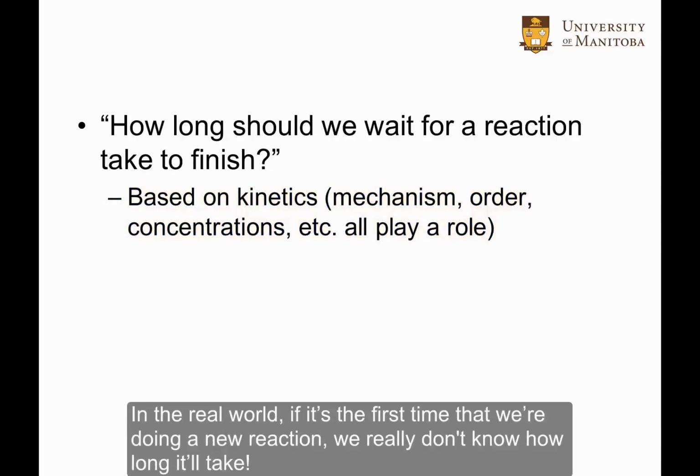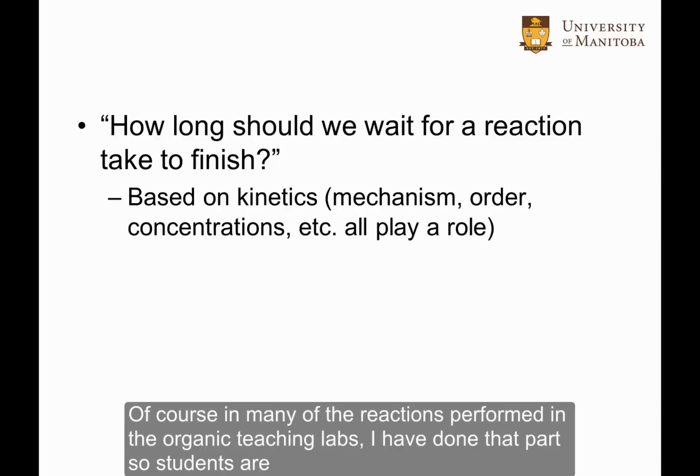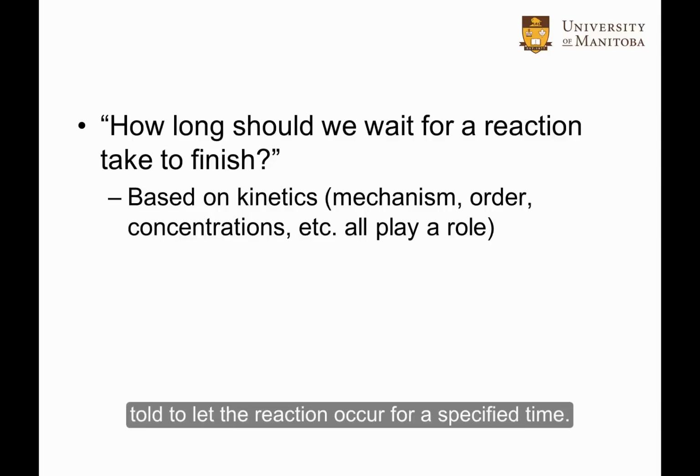In the real world, if it's the first time that we're doing a new reaction, we typically don't know how long it'll take. We typically have to monitor the reaction to determine when the reaction is over. Of course, in many of the reactions performed in the organic teaching labs, I've done that part, so students are told to let the reaction occur for a specified time.